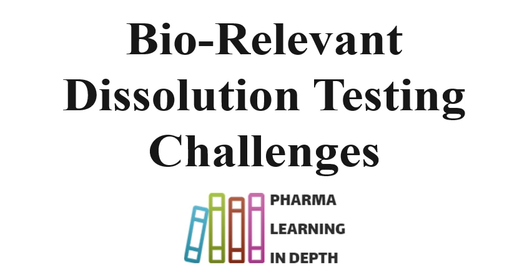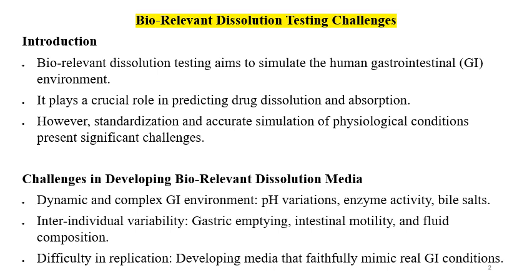The present video is about biorelevant dissolution testing challenges. So first we will understand what biorelevant dissolution is. Biorelevant dissolution is a dissolution test which is performed by simulating the in vivo GI conditions. Let's start with the introduction.